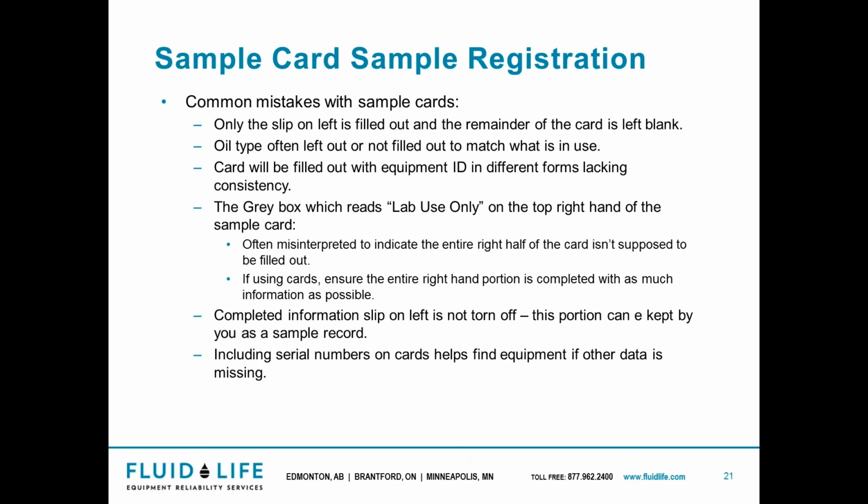Completed information, the slip on the left is not torn off. As I mentioned, that's for you guys to keep. Serial numbers on the cards do help us find your equipment if other data is missing from it.